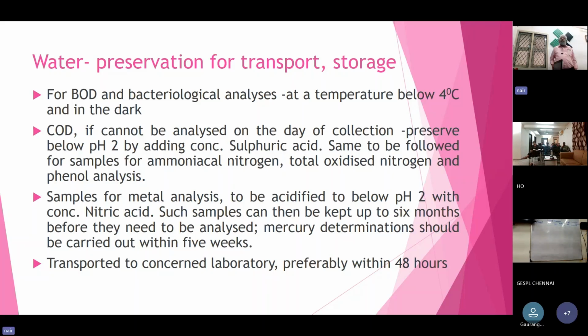Then for COD. If the sample is taken and the analysis cannot be done on the same day, usually it is done after 24 hours because the transportation may take some time, or within 48 hours only. So for COD, you have to preserve the sample below pH 2. You have to ensure that it is below pH 2.